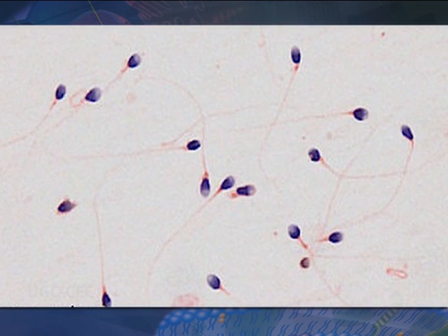Pass the slide through 70% alcohol and stain it with 70% alcoholic eosin for 1 to 2 minutes. After staining, for permanent preparation, slides are dehydrated through 90% and absolute alcohol. Clear the slides in xylene for 30 minutes and mount in DPX. Examine under microscope using a 100x oil immersion objective. In observation: under oil immersion objective, the acrosome of a sperm is seen light blue in color, whereas midpiece and tail are stained pink with eosin.